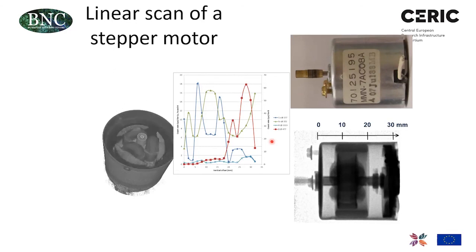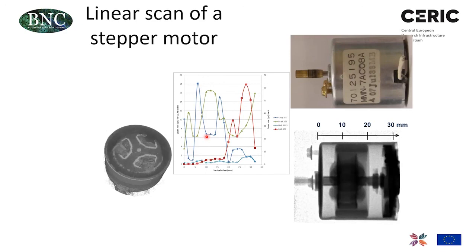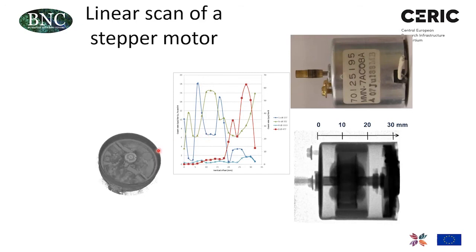But if you look inside, then you can identify that copper comes from the copper coils, iron is from the iron rotator, like here, and then hydrogen and boron come from the printed circuit board, which is at the bottom of the stepper motor, which is over here. So by the joint interpretation of imaging information and elemental composition measurement, we can better characterize such a non-homogeneous object.